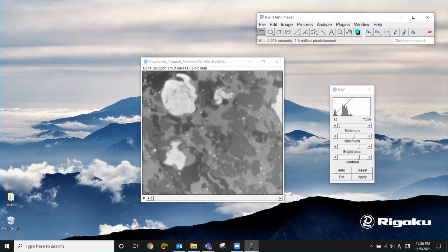Usually you don't need to get to this point, but as you can see, there are many different ways to reduce the file size. And if you ever have to reduce the file size even further, you can switch from TIFF to something like JPEG. Again, TIFF is a lossless format, meaning that you don't lose anything when you save the image in TIFF.